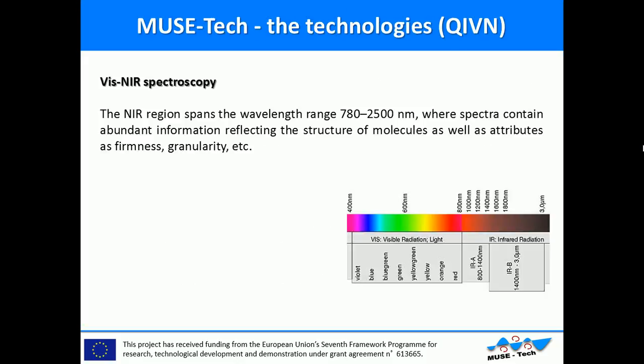The first sensing technology implemented in the project is the visible NIR spectroscopy.